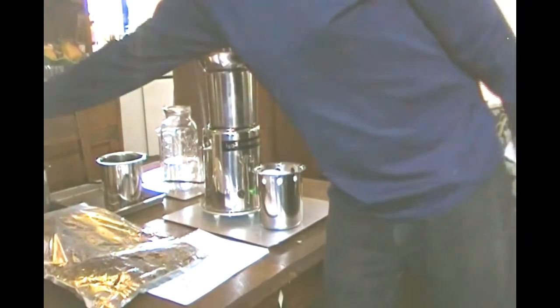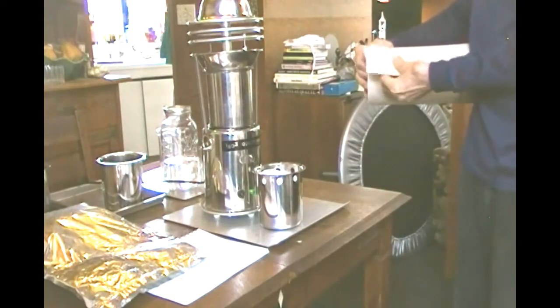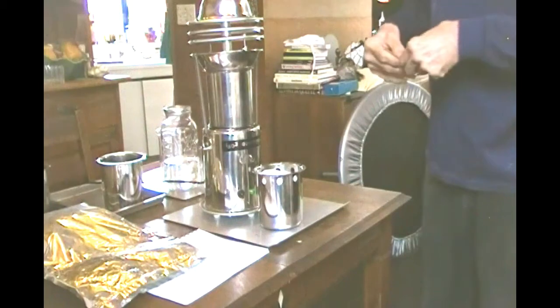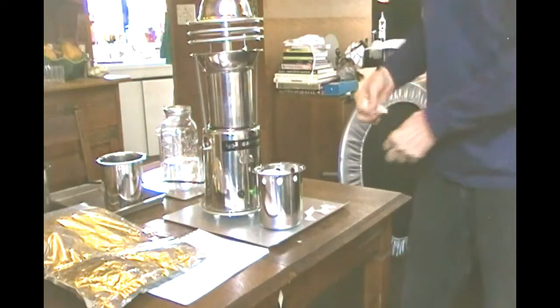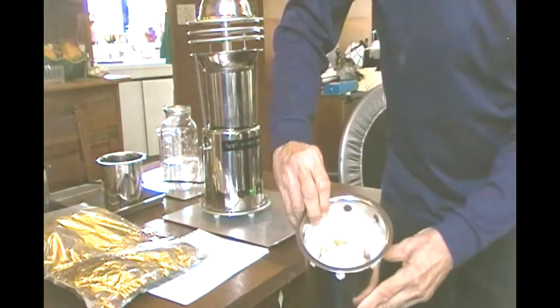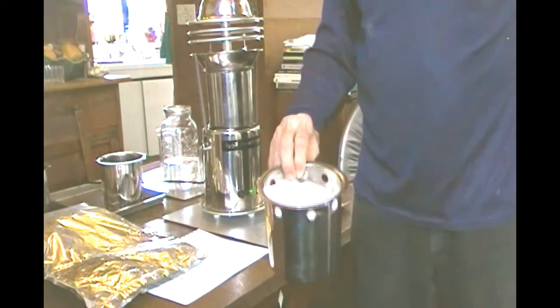Now we take a piece of paper towel and we make what's called a spreader sheet. And the purpose of this is to spread out the drops of alcohol which will drip into the center of the extraction basket. So something about like this, make it kind of round. We want to make sure when we put the spreader sheet in that it doesn't touch the filter paper. It should come kind of close but not touch it. So it is right there in the center. And what this does is as the alcohol drips onto the spreader sheet, this will cause it to disperse out over the entire charge of hops flowers.